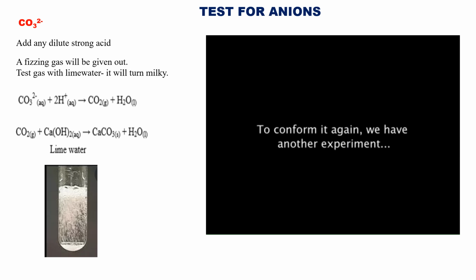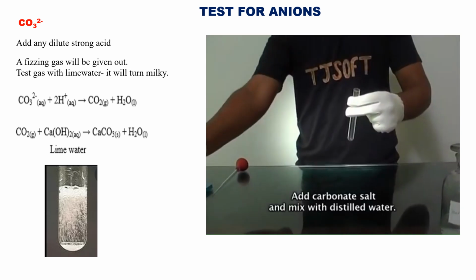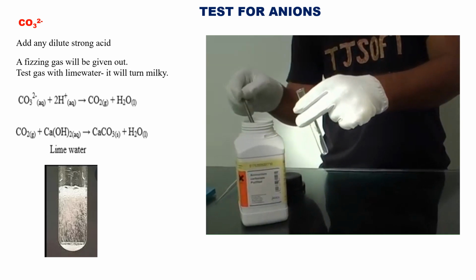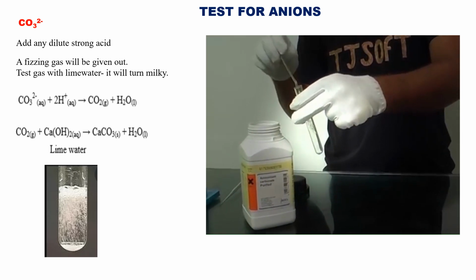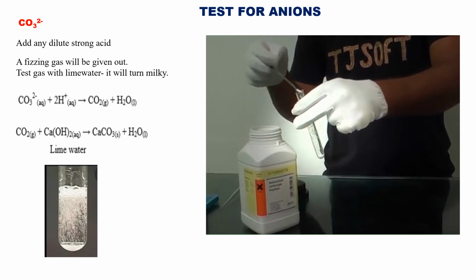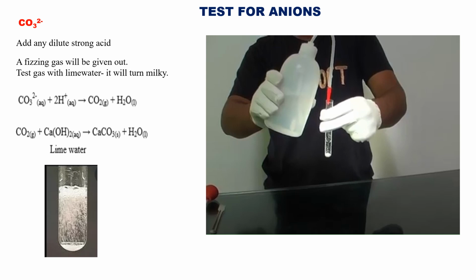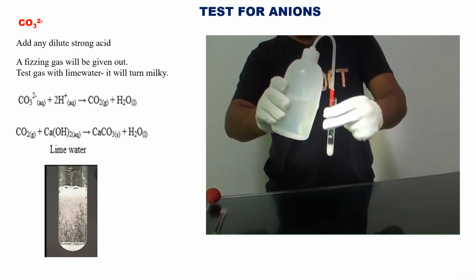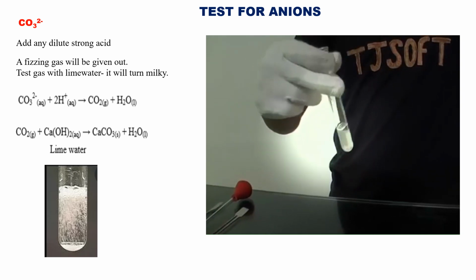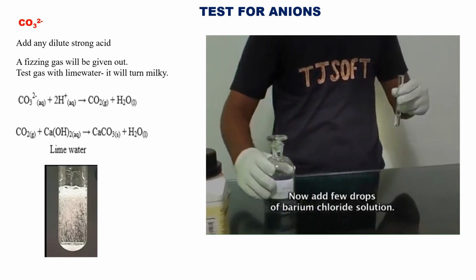To confirm this again, we have one more experiment. Now take a clean test tube. Add carbonate salt and mix with distilled water. Now add a few drops of barium chloride solution.